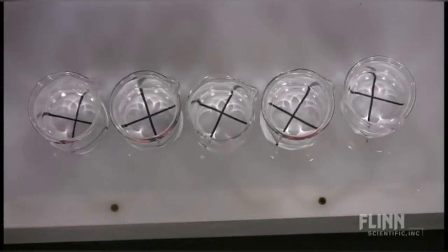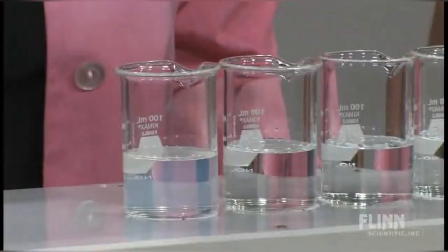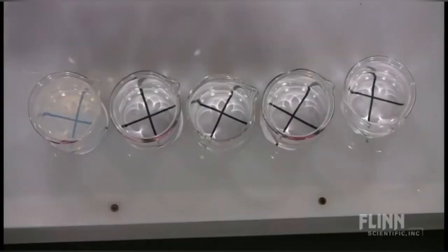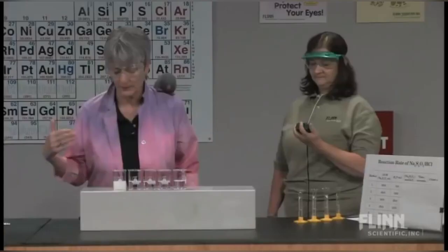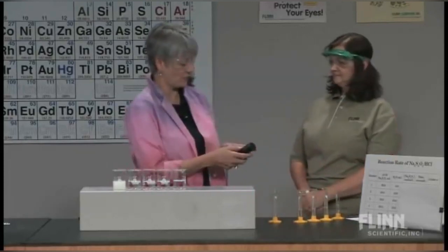All right, now I'm going to tell you when that X disappears. If you look from the side, you should start to see the cloudiness on the side. All right, now you're looking down. Stop. Okay. How many seconds did that take? 18.68. 18.68 seconds. All right, thank you.